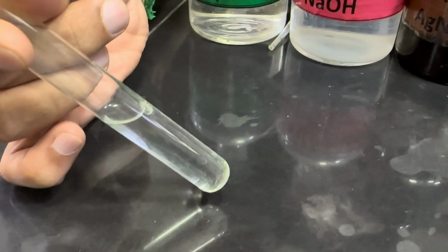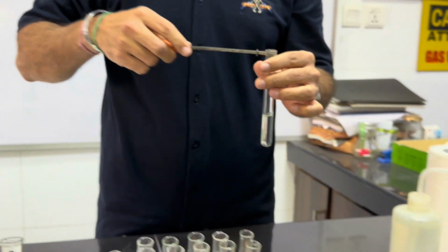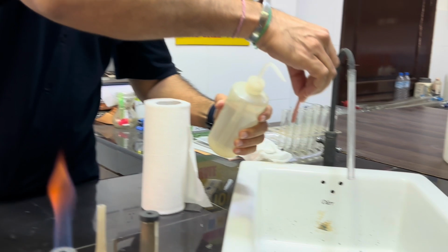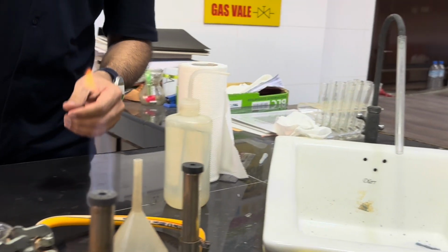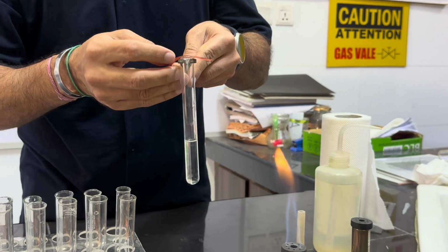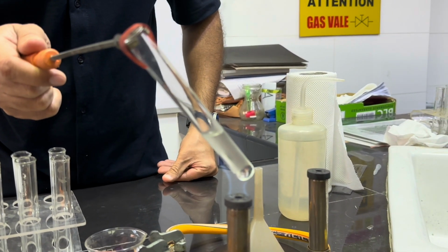And now we will warm this test tube with damp red litmus paper. We put a test tube holder here, and then we will use damp red litmus paper. So this is the litmus paper. Damp this first. We'll put this litmus paper on the top. We will bend it from the corners so that it won't fall. And now we will tilt the tube and we will warm.